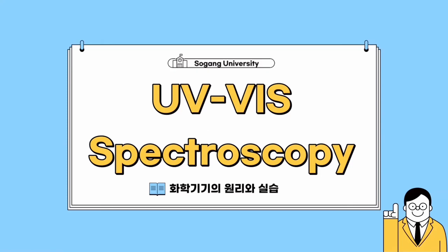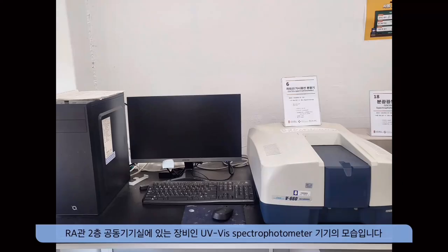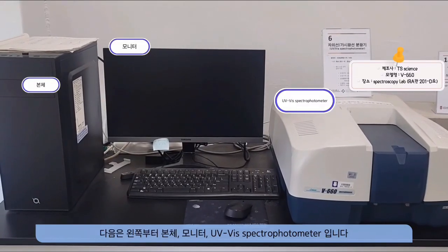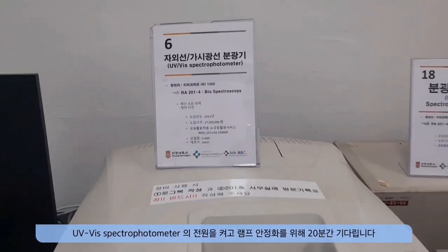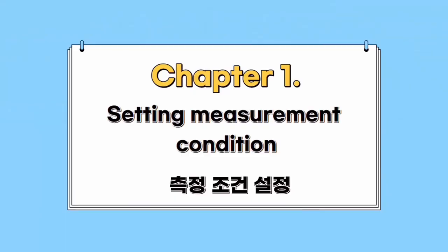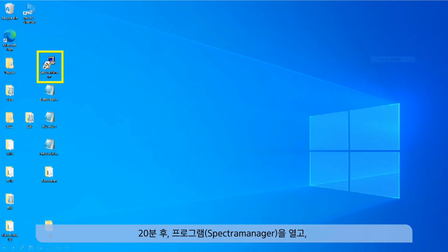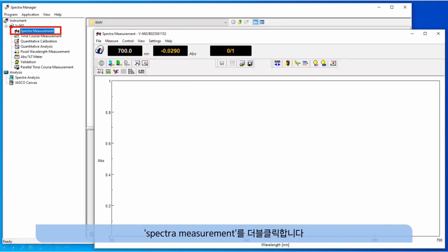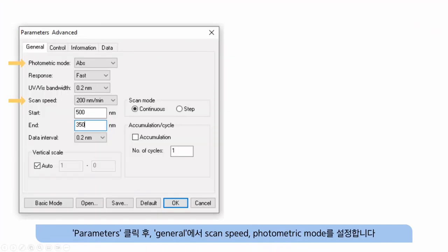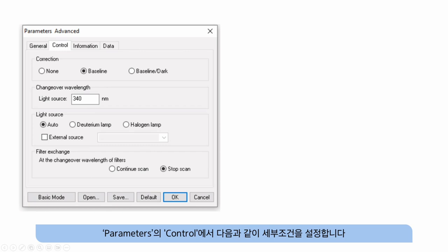Instructions for using the UV visible spectrophotometer at Sogang University. Turn on the UV visible spectrophotometer and wait 20 minutes for the lamp to stabilize. After 20 minutes, open the spectra manager program and double click on spectra measurement. Click parameters and set the scan speed and photometric mode in the general section. In the control of parameters, set detailed conditions as specified.